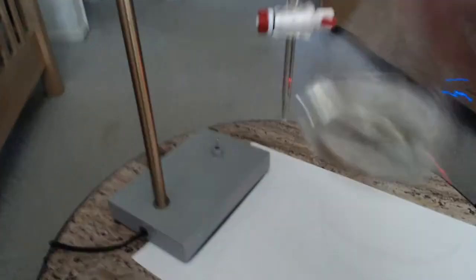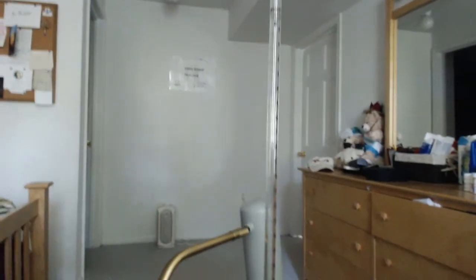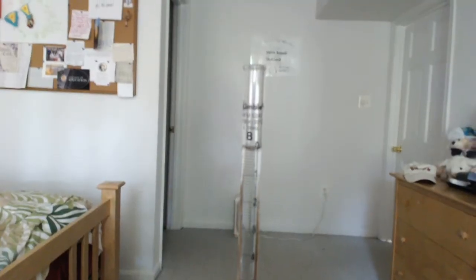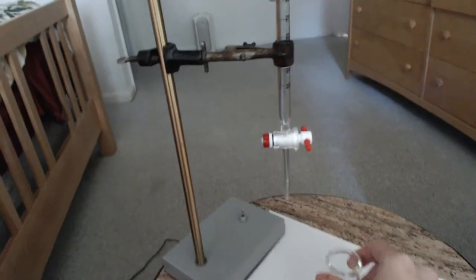What I'm going to do is fill up this Buret. I'm going to move this, this is our acid solution. What I'm going to do is fill up this Buret with the basic solution that I prepared earlier that has a molarity of 1.5. So I'm going to go ahead and pour that in up at the top until it reaches the volume of 0. All right, as you can see, I've filled it up to the 0 mark with the base. So the whole Buret is ready to go. I've got my acid here, and I'm about to move on to the next step.